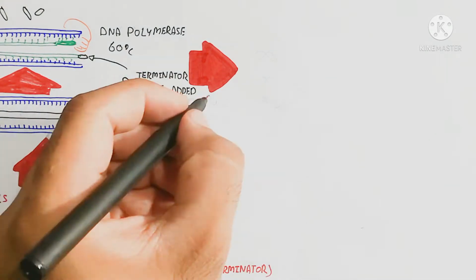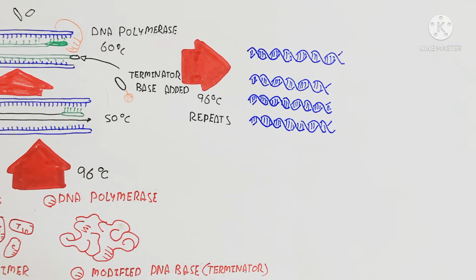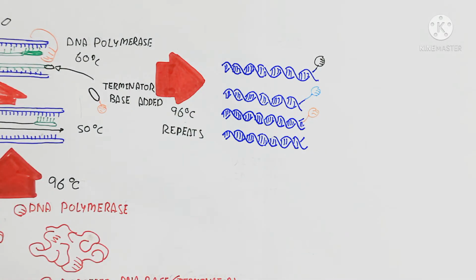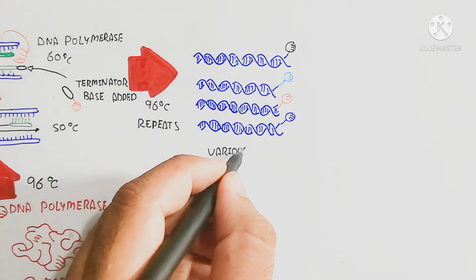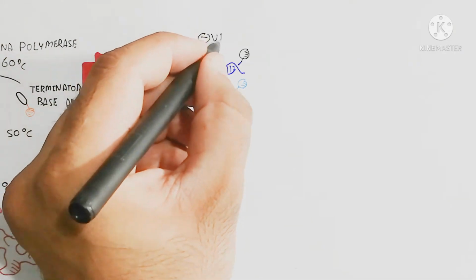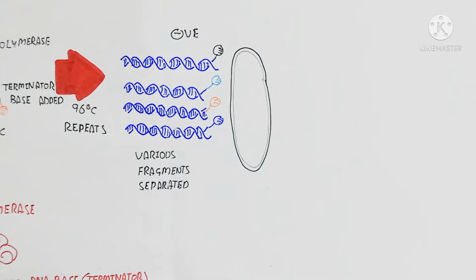This process is done in the PCR, the polymerase chain reaction, because the DNA polymerase enzyme is used to amplify more of the same DNA segment. So the complementary strand will be formed. It means the daughter DNA is the same as the parental DNA, because the nucleotide attaches opposite to its partner. I hope that makes sense.